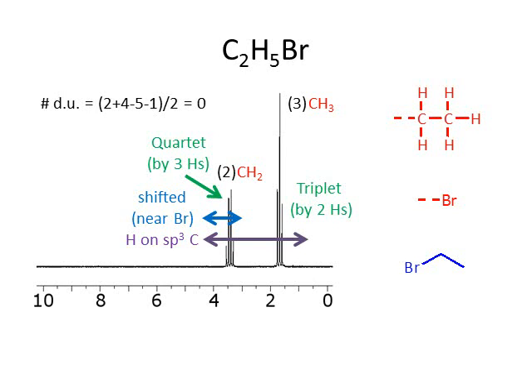There are a CH2 and a CH3, and the CH2 is next to a CH3, and the CH3 is next to a CH2. By the way, that's always going to be true, right? Because if I am standing next to you, then you are standing next to me. And so they are going to have this kind of mutual effect.